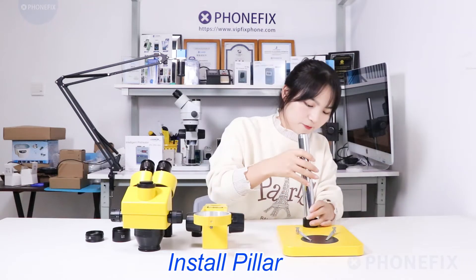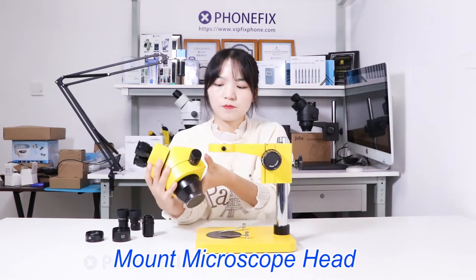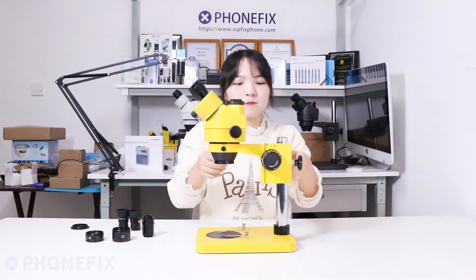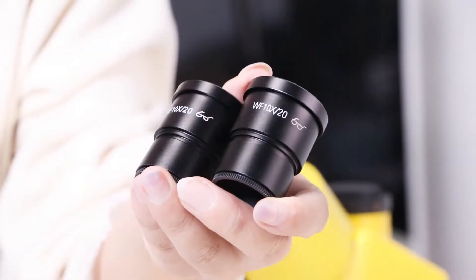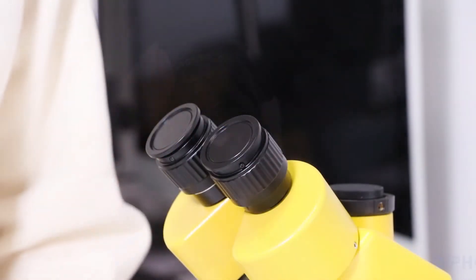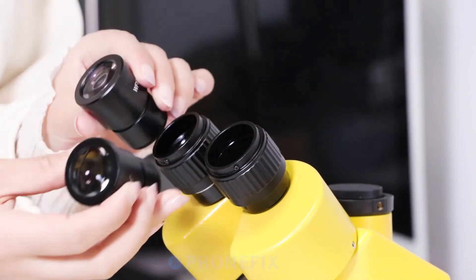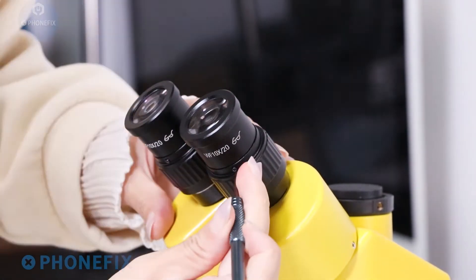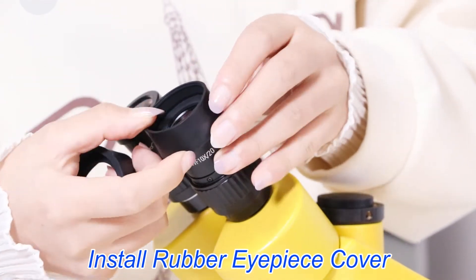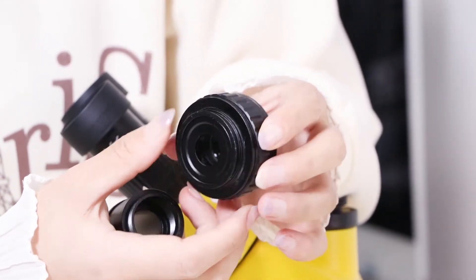Now let's install the microscope. It's a pair of eyepieces and the model is 10-20. Now let's install the eyepieces. It's a rubber eye guard. Here is a pair of adapters and this is a 0.5 adapter. Now let's install that.